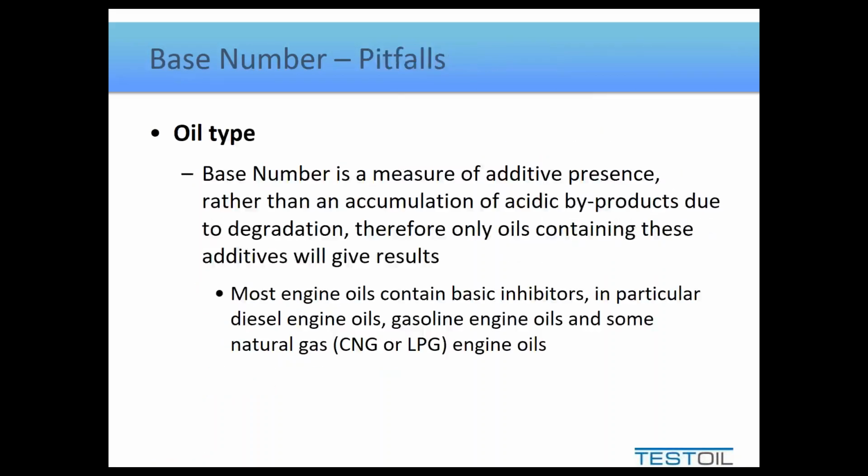The only thing that really changes, the last thing I have to say, is that the pitfall with base number is that it can only be done on certain oil types. I just want to reiterate that one more time to make sure people aren't going to ask for base number in applications where it's not going to yield them a usable result. So base number can only be done on oils that are actually additized with an alkali or basic additive package. And this, like I said, is predominantly in the combustion engine market.